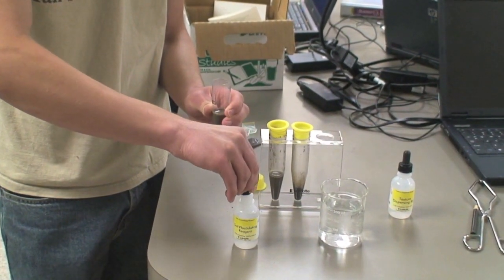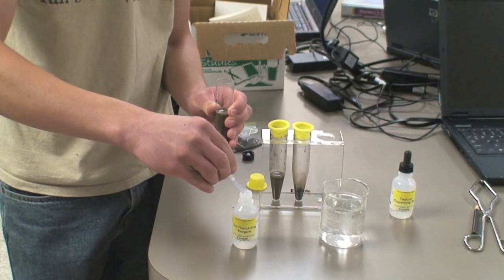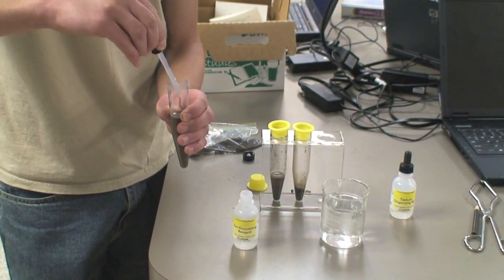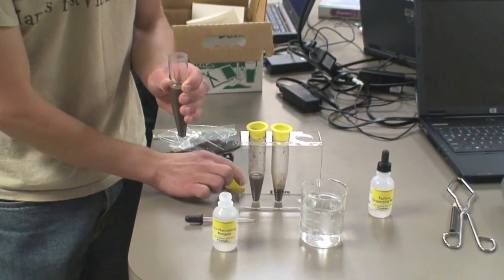If you are going to use the clay portion from the soil for further testing, add one milliliter of soil flocculating reagent to the last tube, cap it, shake it, and let it sit overnight.